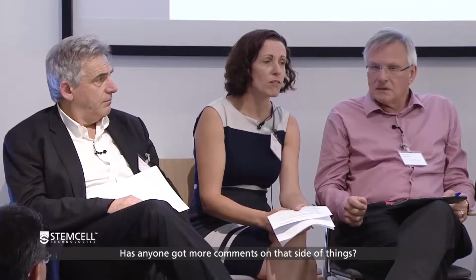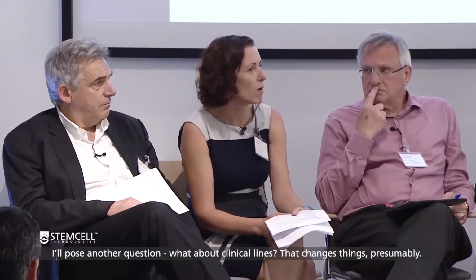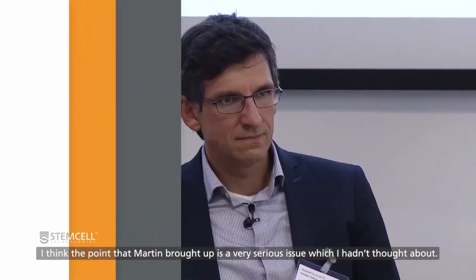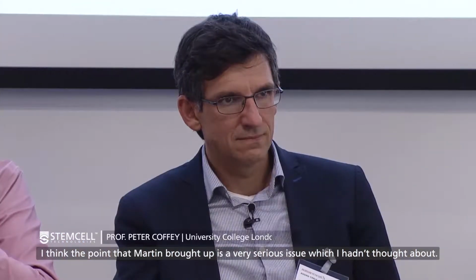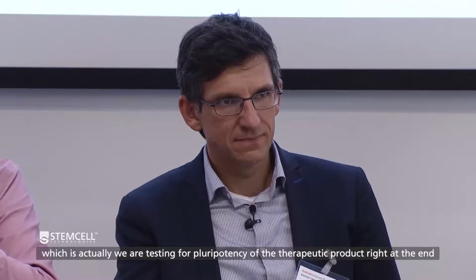Has anyone got more comments on that side of things? Or to pose a slightly different question, what about clinical lines? That changes things, presumably. I think what Martin brought up is a very serious issue, which I hadn't thought about until Martin brought it up, which is that we are testing for pluripotency of the therapeutic product right at the end.